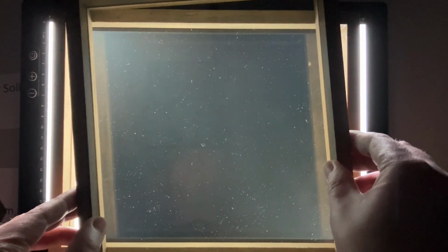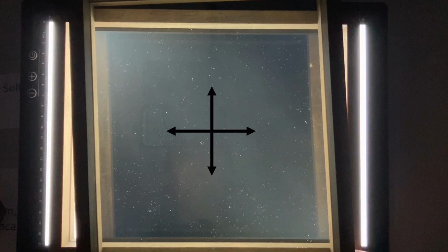But in order to explore a whole host of other optical phenomena, we're going to need a second polarizer, and we're going to want to orient this upper polarizer so that its vibrational direction is perpendicular to our first. Our first polarizer allowed light to pass that was vibrating in an east-west vibrational direction. This upper polarizer is only allowing light to pass in a north-south vibrational direction. Our polarizers are crossed polarizers, and so very little light is making it to us. That is, unless we put a mineral sample in between our polarizers, and then the structure of our mineral can do interesting things to light.